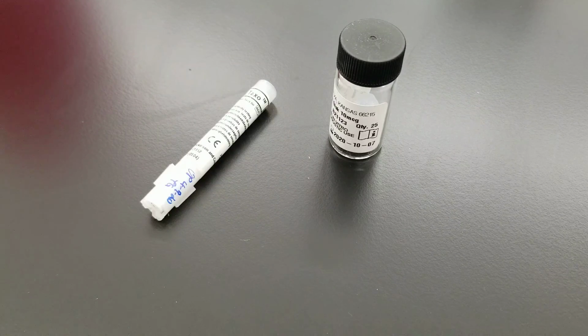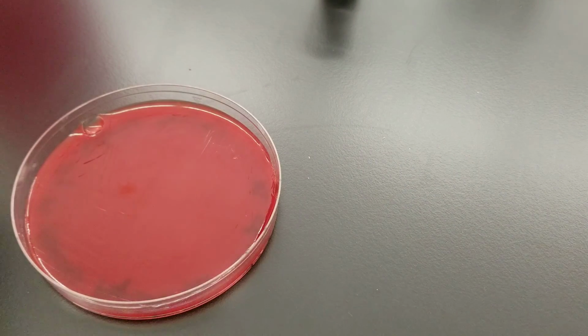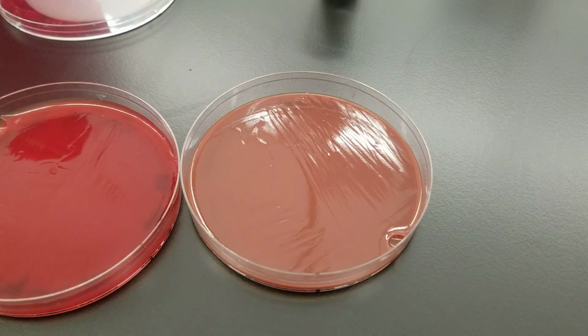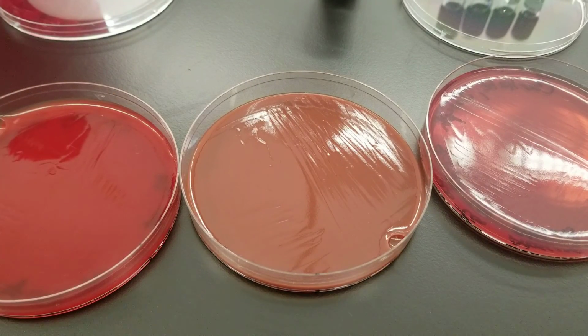So the primary setup that goes into the CO2 incubator has our blood, our chocolate, and our McConkey. What we're looking for are various pathogens, depending on the body site, obviously, that would grow on all of them or only some of them. And so we're matching growth with gram stain information and what it is that we're expecting to see due to the body site.